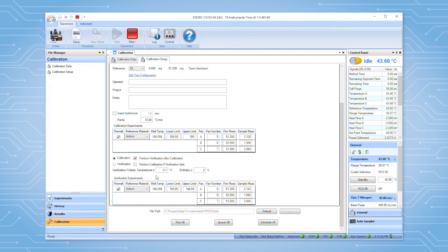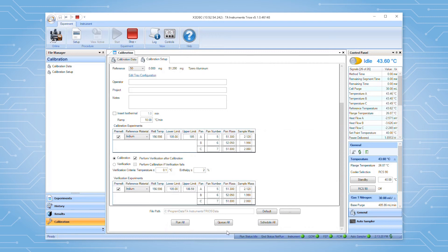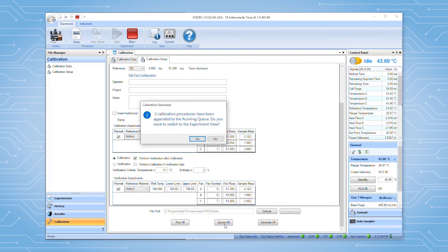Once you are finished filling out the experiment form, you can send the calibration experiments to the running queue and start them automatically using the run all option, schedule them to be run at a later date with the schedule all option, or in this case, send them to the running queue for final review with the queue all option.